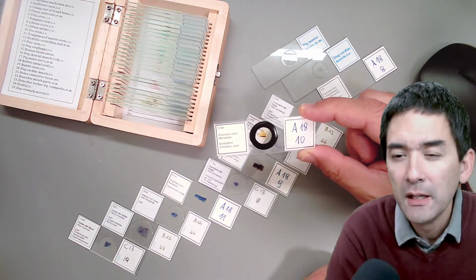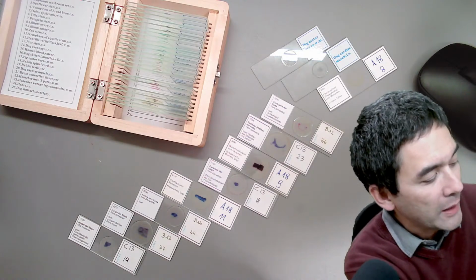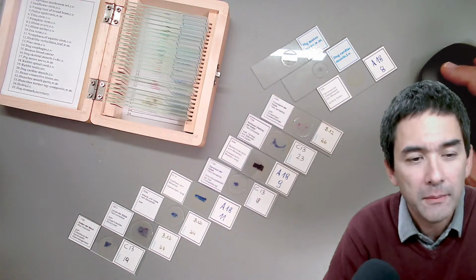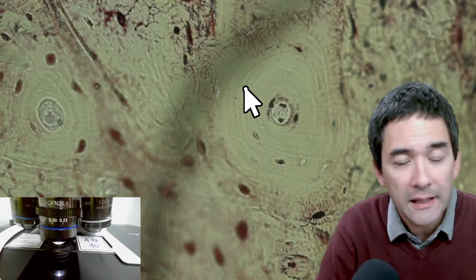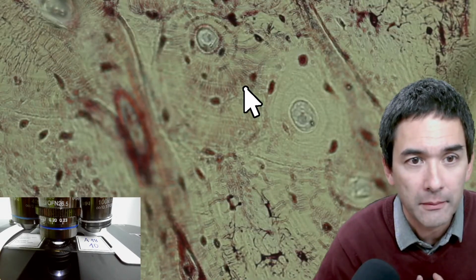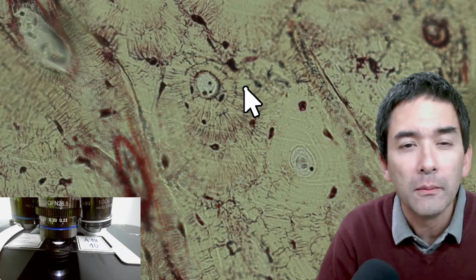How it's processed. Is our blood made in our bones? I find that fascinating. Yes, the white blood cells, for example, are made in the hollow bone, so basically in the bone marrow. It's very important for the immune system. But again, I have to tell you, with the question of how it was stained and how it was processed, you're speaking out of my heart, because I don't know, and I myself would like to know this. Here we see it much better.